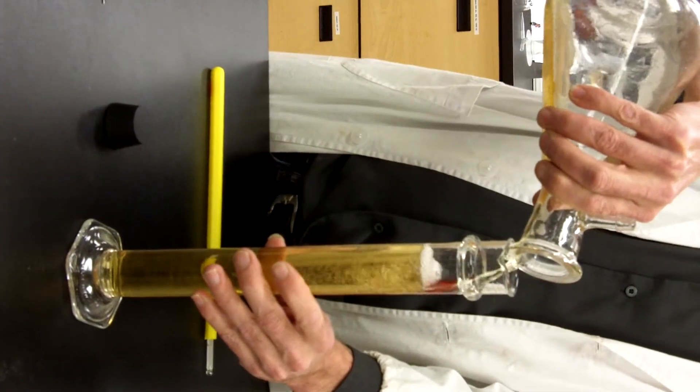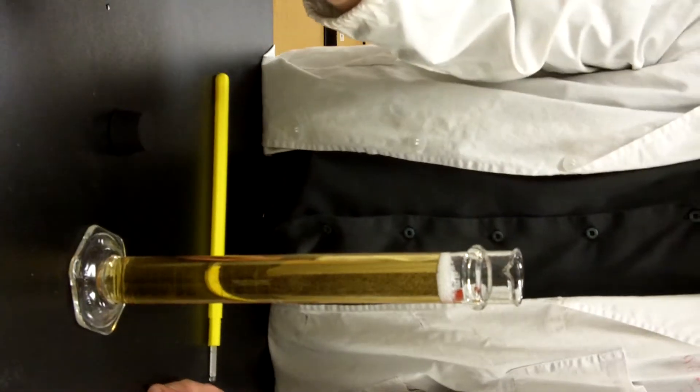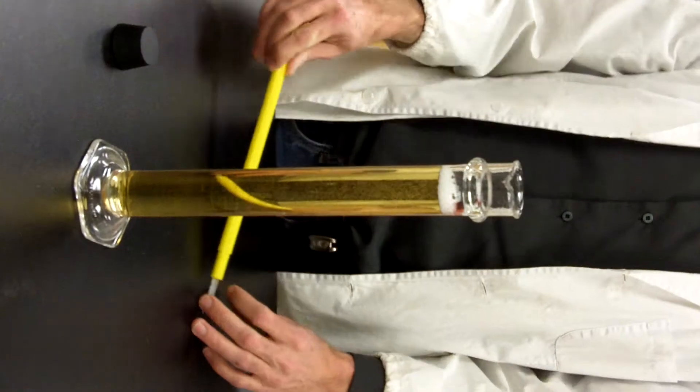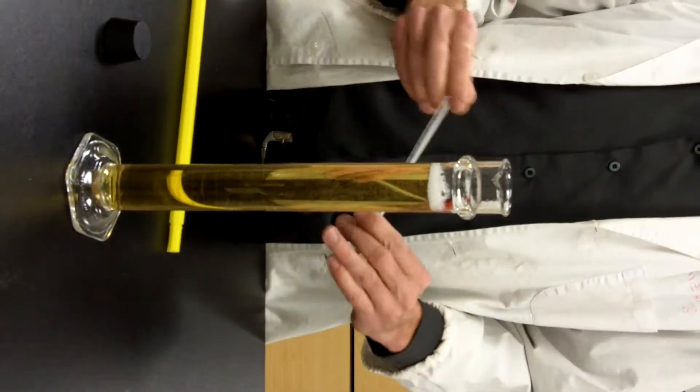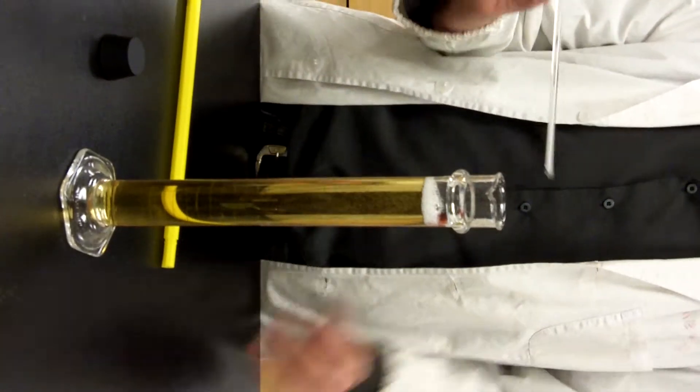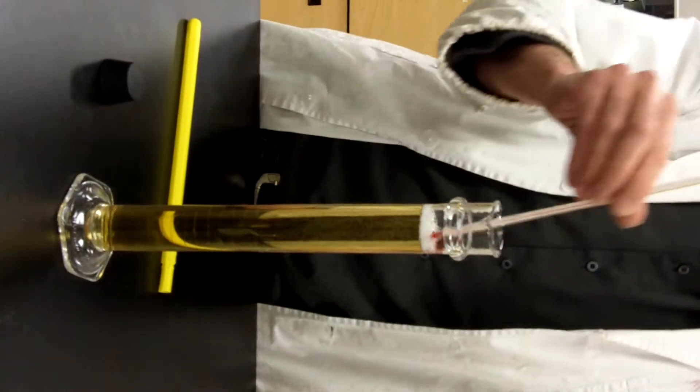And we do exactly the same for the wort. We don't degas the wort because it's got no carbon dioxide in. Now because we have to correct the specific gravity for temperature, we have to take the temperature of the beer first.